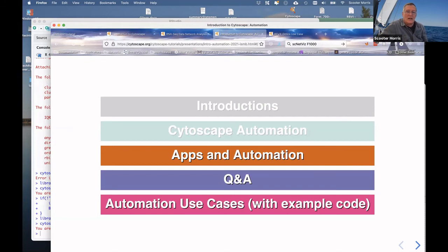Okay. You should be able to do the same thing just in R. RStudio just happens to be very convenient, but you should just be able to launch R and type in the same commands. There's nothing RStudio specific.